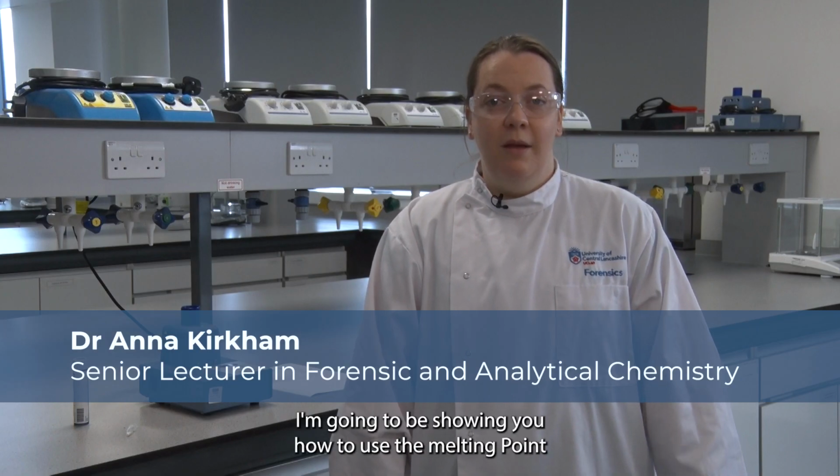Welcome to this tutorial. I'm going to be showing you how to use the melting point apparatus to record a melting point.